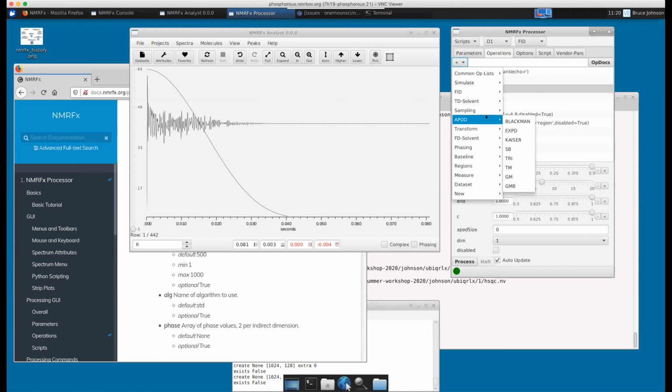One can do trial and error. I don't know, and this is probably a whole good session with some of the more NUS experts, but all of these functions, as you say, are going to interact with the NUS processing to some extent.